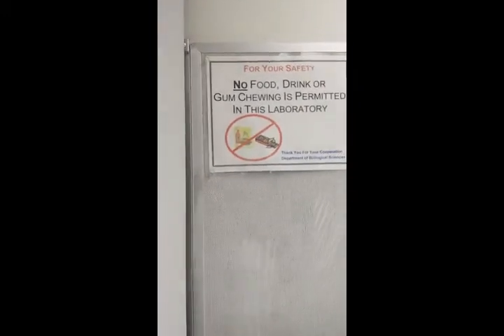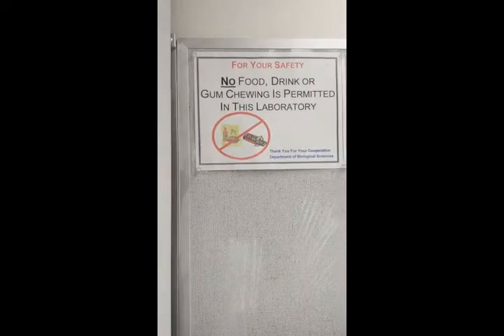The first thing I want to mention is that you should never eat, drink, or chew gum in the microbiology lab. You should not put pens, pencils, or your fingers in your mouth.